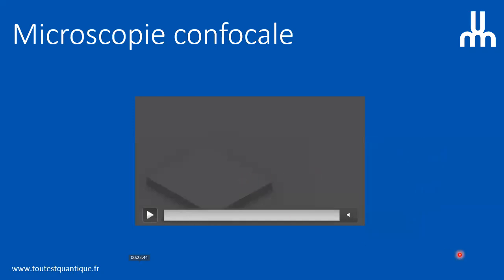How frequent is the use of an emission pinhole like this in standard confocal scanning? In the standard one, I don't think they use it anymore because we have much better ways to select the light. It's still done in a spinning disc confocal, where you have a pinhole at the beginning and at the end. Yeah, it's not something standard. I think it's because the people that made the video are really into physics, but they use this. So it was not only about optical microscopy.